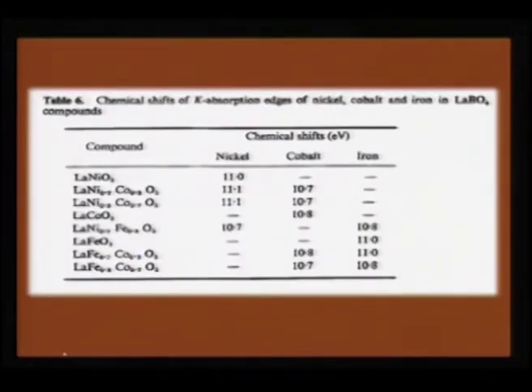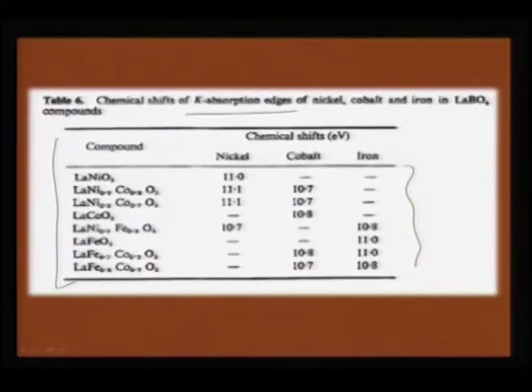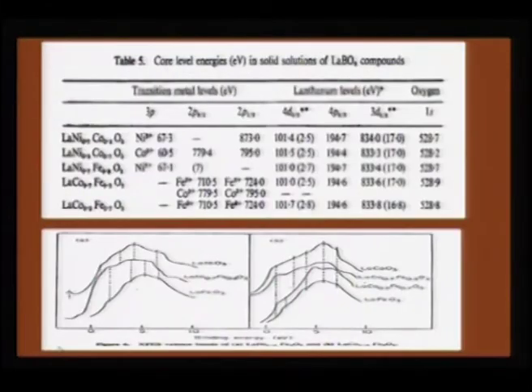And here again there are other examples given. Only thing in this case it is about K absorption edge, therefore you can see the values are much less because we are talking about the K shell. So, the K absorption edge can also serve as a useful number when we try to map between substituted ones and the parent perovskite oxides.